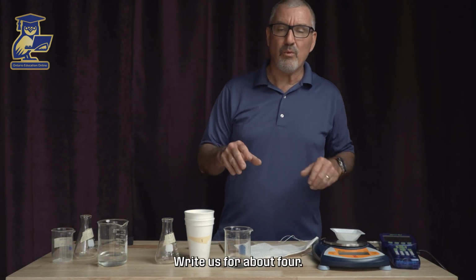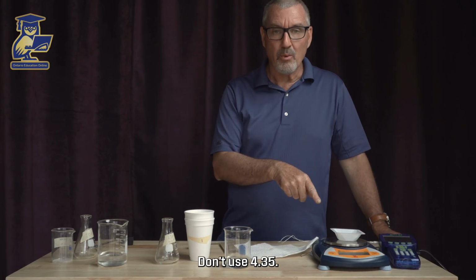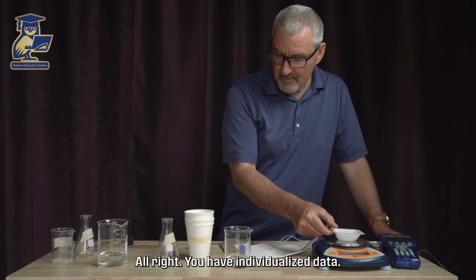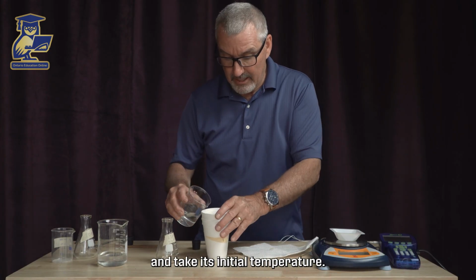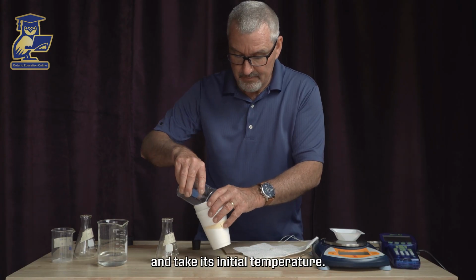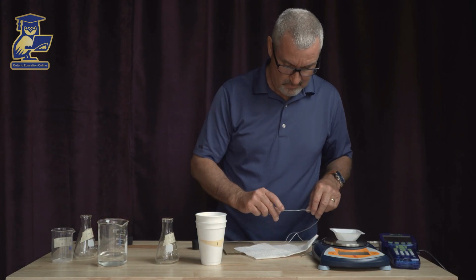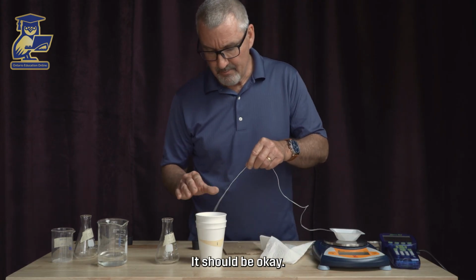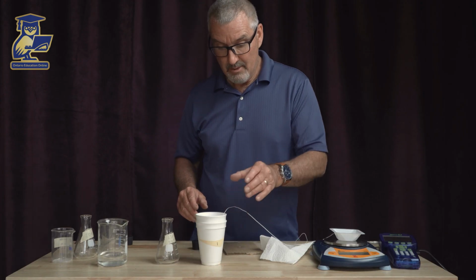All right, it asks for about 4. Again, step 6, use your data. Don't use 4.35, use your data. All right, you have individualized data. And we're going to pour this water in here and take its initial temperature. Right, make sure this is wiped off. It should be okay. So we want to take, again, the enthalpy change.